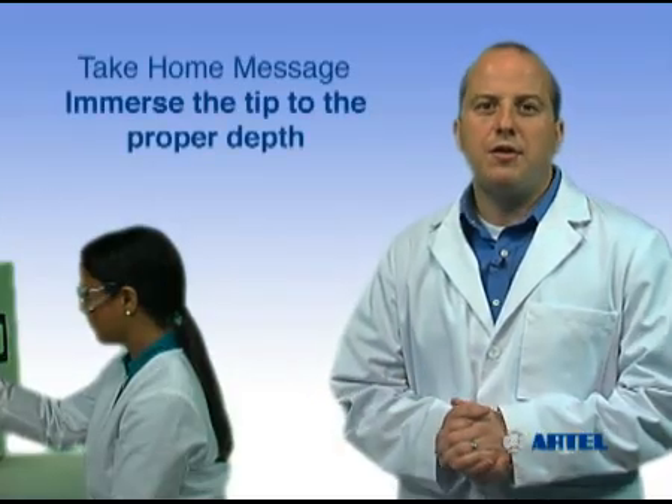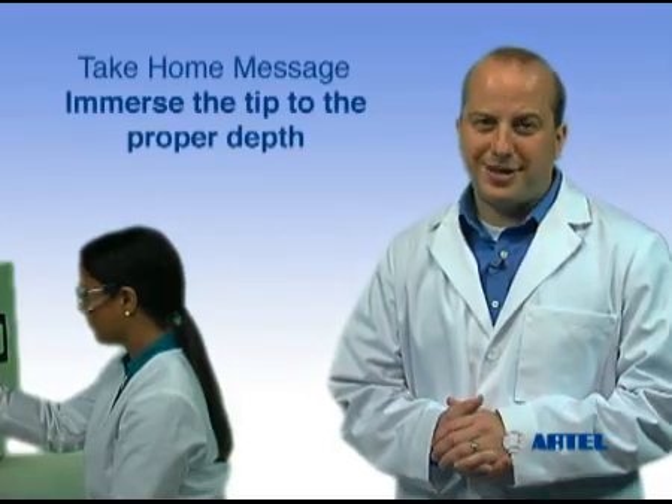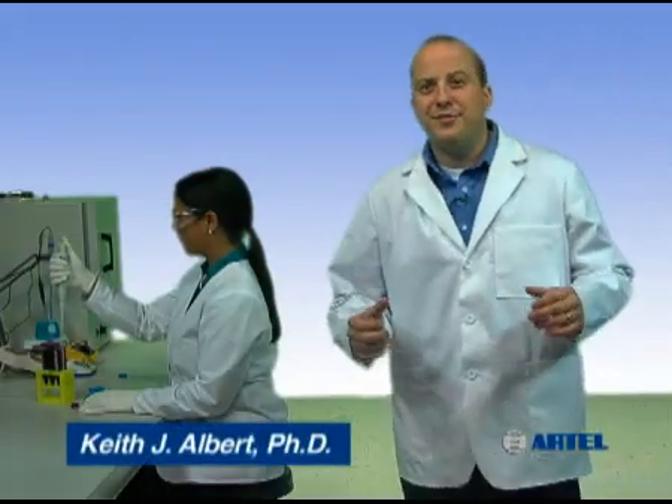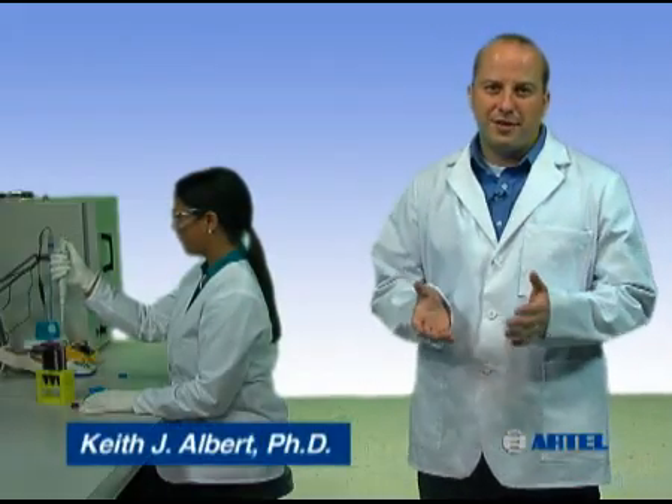The take-home message is: do not immerse the tip too far into the sample. By using proper pipetting technique, you can help ensure liquid handling quality in your lab.